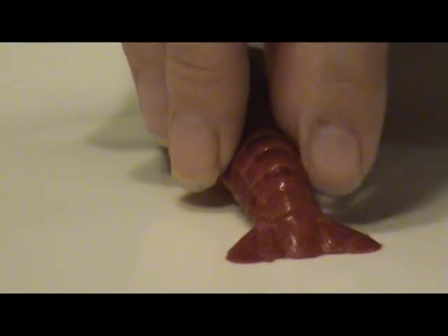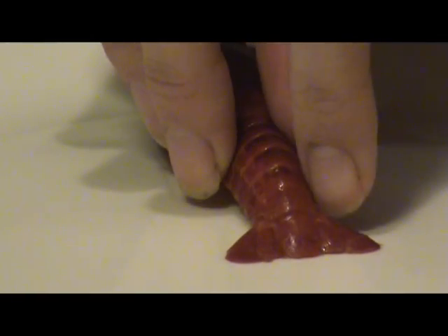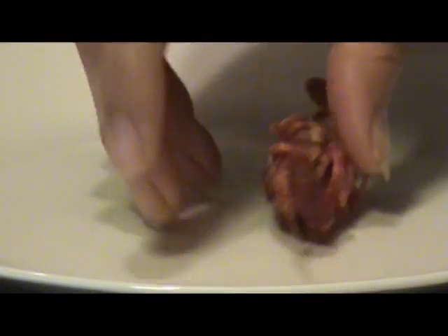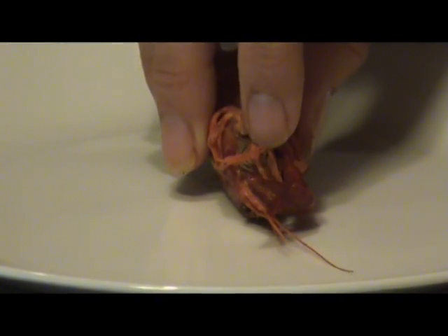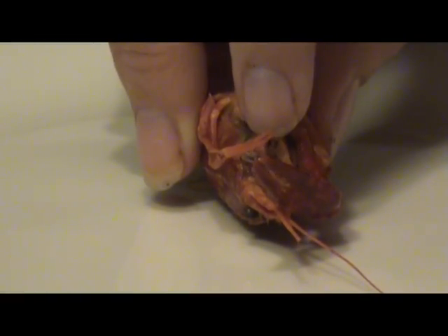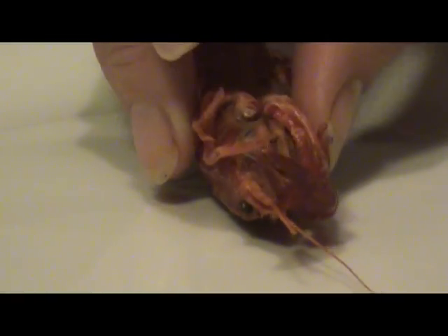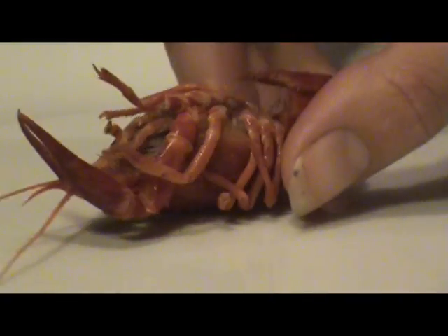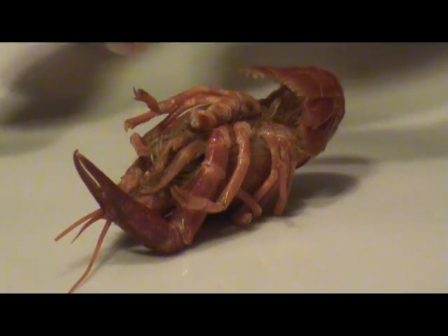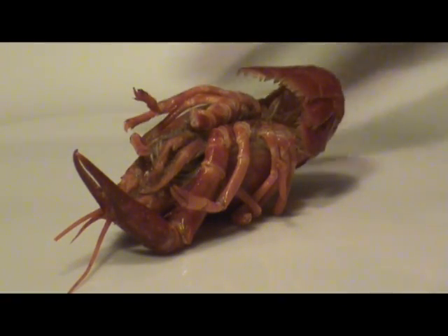On either side of the telsin, we have the uropods. Now let's flip our crawfish over. You'll notice here these two claws are the feeding appendages — it's how they get their food to their mouth. These are the walking appendages; there are four on either side, so eight all together.